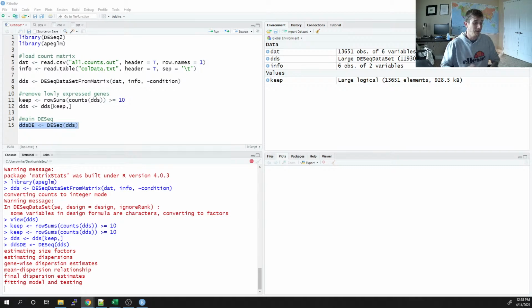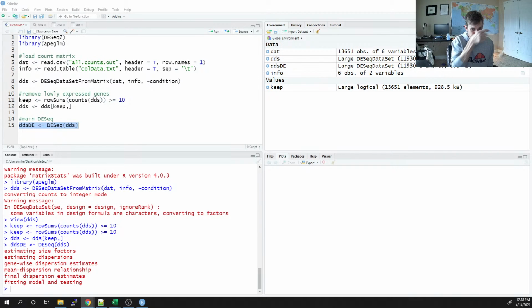and if we have a library, say, that has 1,000 reads in it, and for a specific gene, 100 reads mapped to that specific gene, right? So 100 out of 1,000, like 10% of all reads mapped to a gene. But we have another library that has 1,000,000 reads in it, and say 100 reads mapped to that specific gene.